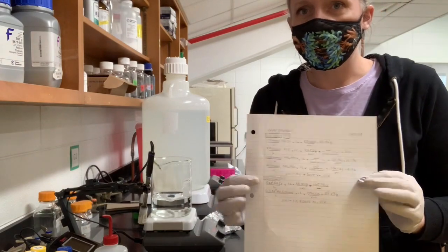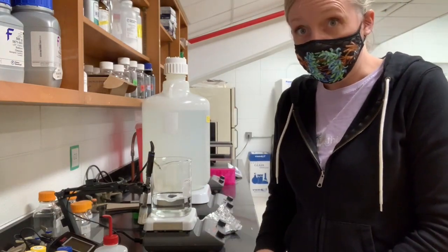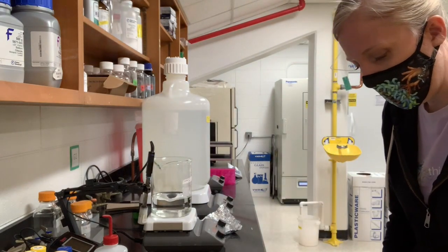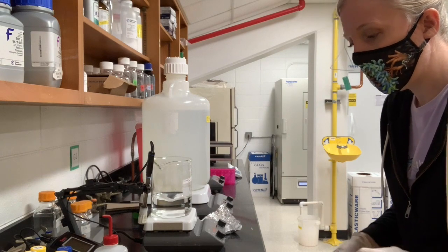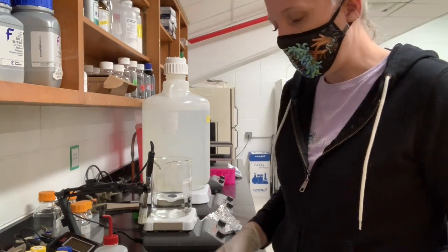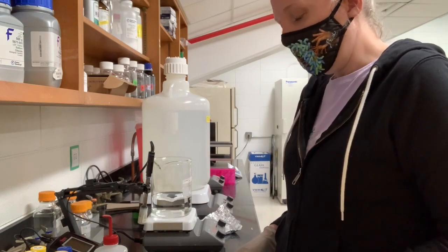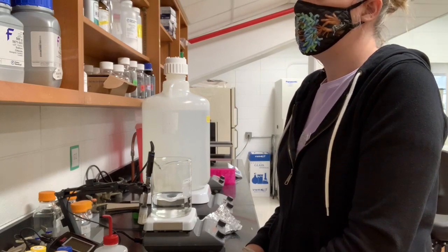And for this 10x PBS, I've written out my recipe. I have all of the components written down, and I'm going to start out by measuring out the 4 salts. PBS stands for phosphate buffered saline, and I'm going to measure out the 4 salts that I mentioned, the first of which is sodium chloride.